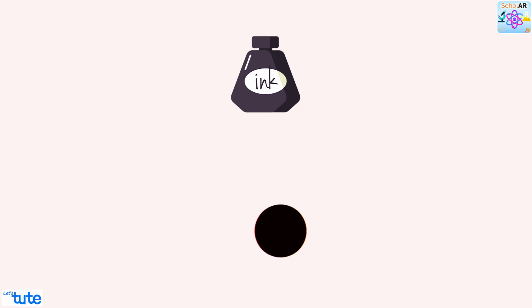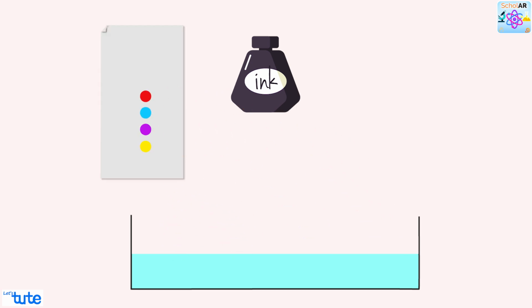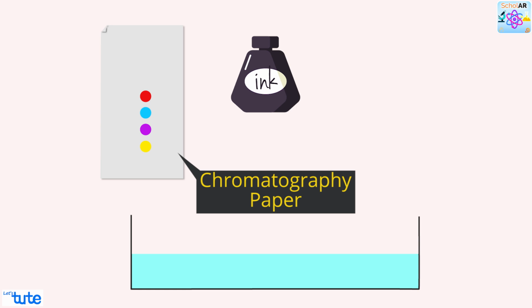In many instances, we can separate these materials by dissolving them in an appropriate liquid and allowing them to move through the absorbent matrix like paper. But this is not any regular paper. It is the chromatography paper. Well, you just don't have to take our word for it. We will separate all the components in this session.